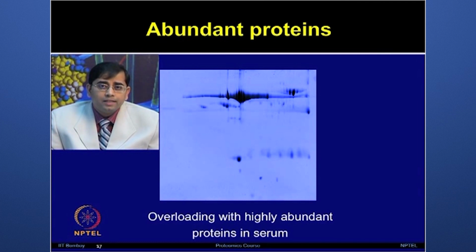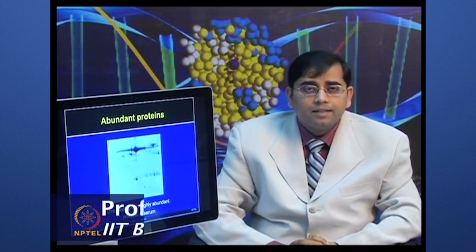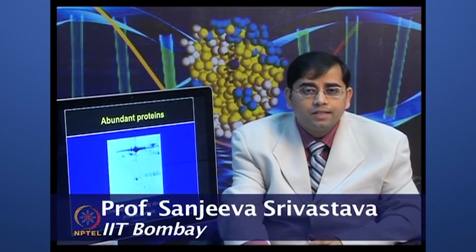These abundant proteins mask many smaller proteins and create problems in two-dimensional electrophoresis because of the IEF process, and when you stain the gel you can see streaking, as well as the whole region masked because of the abundance of that protein.